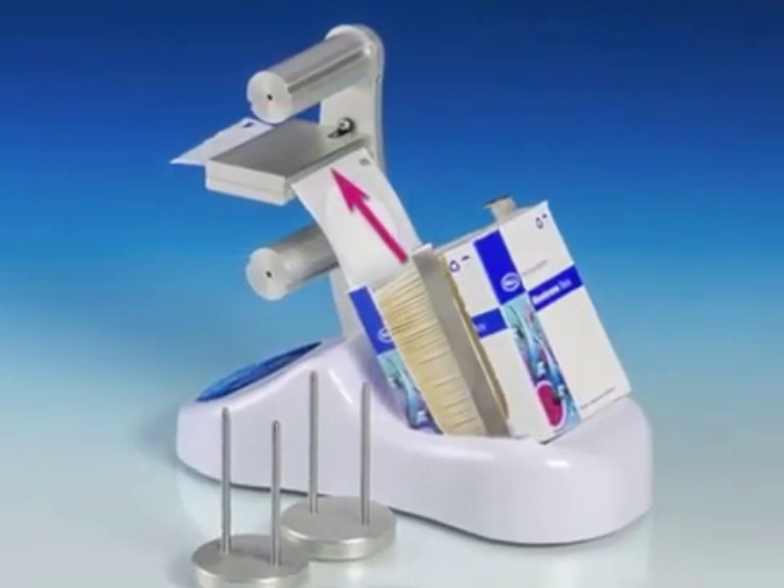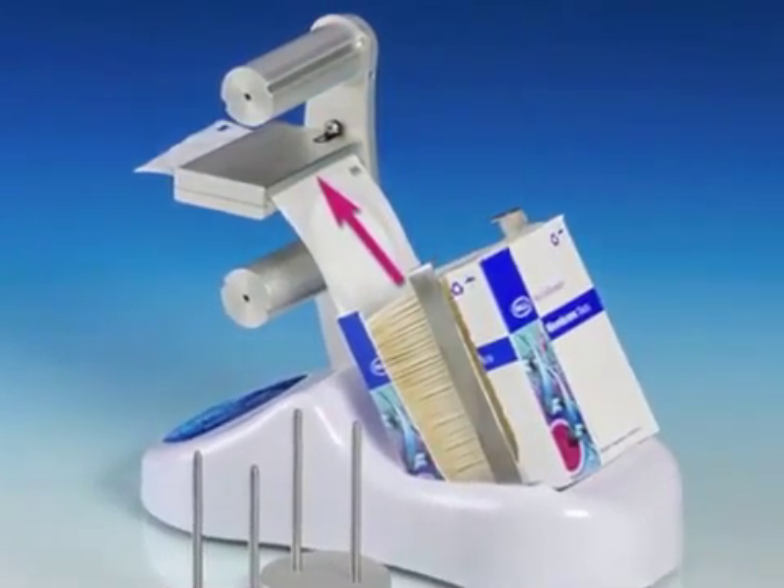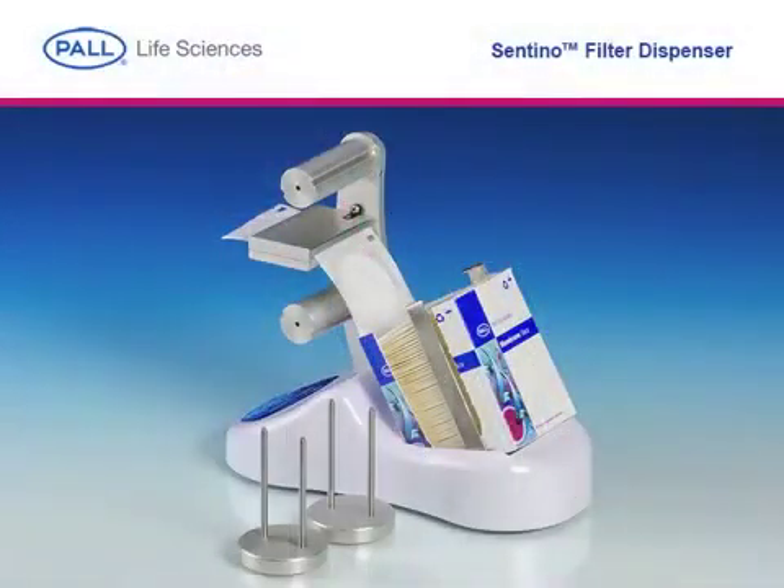Remove the retainer clips from the upper and lower spools and insert the fan-folded media between the membrane guide plates as shown. The guide plates help maintain alignment of the web during loading and operation to prevent jamming during use.